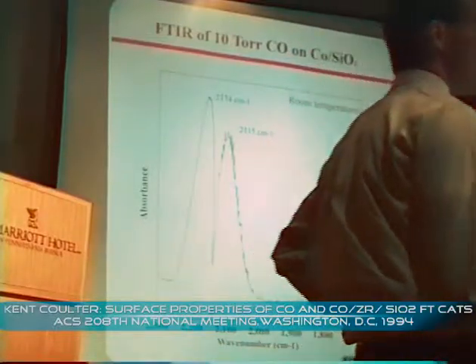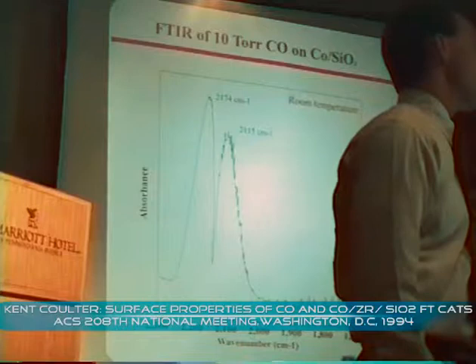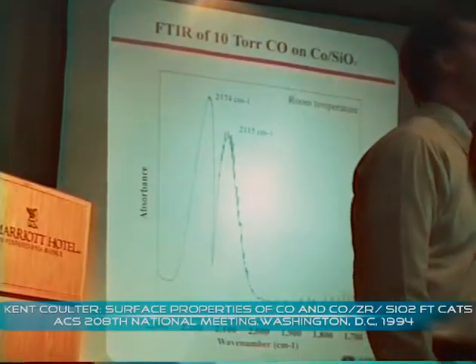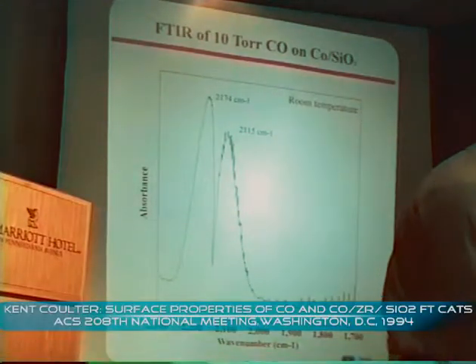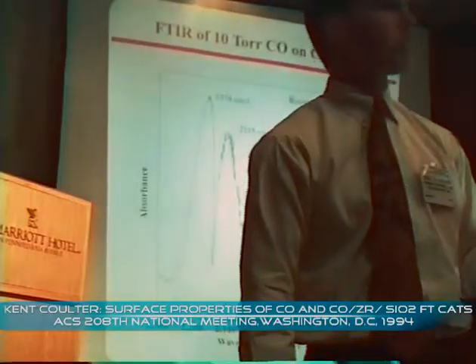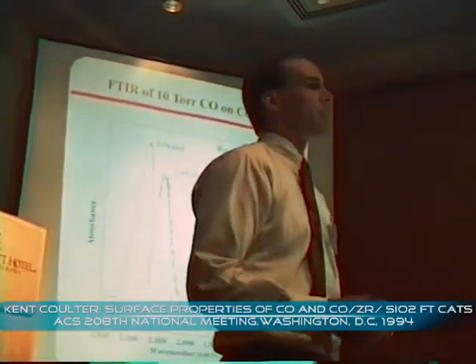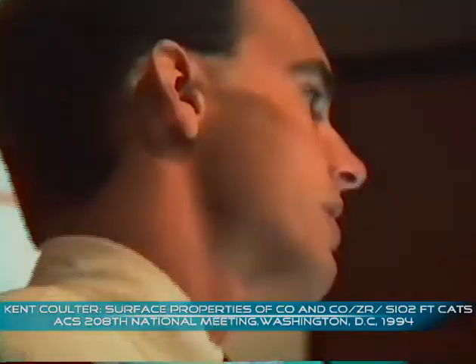If we remove the CO from the IR cell, we don't see any features that can be identified as molecularly adsorbed CO on these cobalt on silica or cobalt zirconia promoted catalysts. Now, we've made several attempts at seeing molecularly adsorbed CO. We've cooled the sample, we've heated the sample, we varied the CO pressure, and after several very frustrating weeks where we were not able to see molecularly adsorbed CO, we sent these samples to our colleagues at Los Alamos.